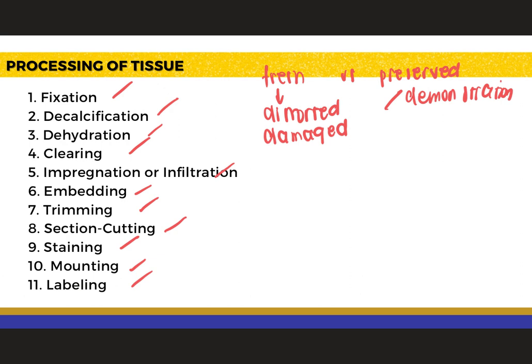So, what are our different decalcification solutions? We have your HCl, also formalin plus HCl, or EDTA only for slow decalcification for immunohistochemistry. We also have your dehydration. In here, we dehydrate, or we remove the excess water from the tissue.